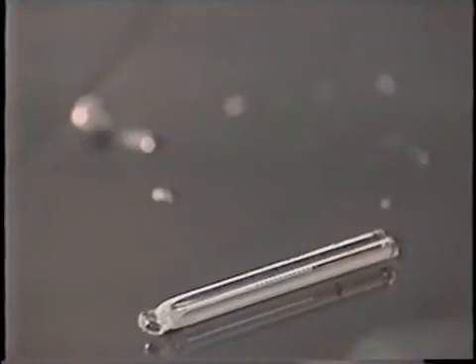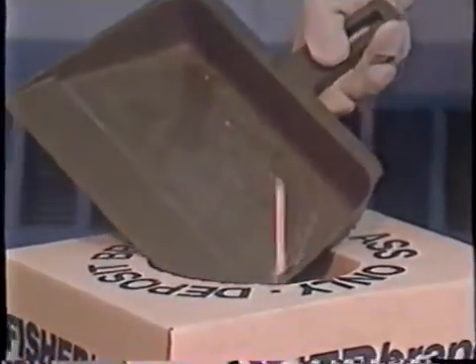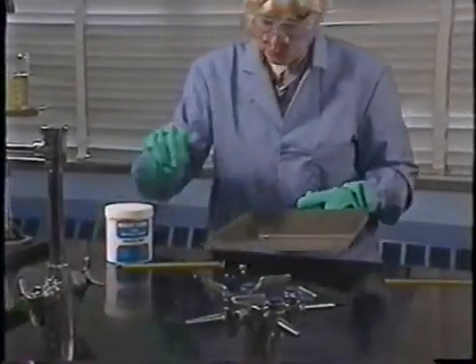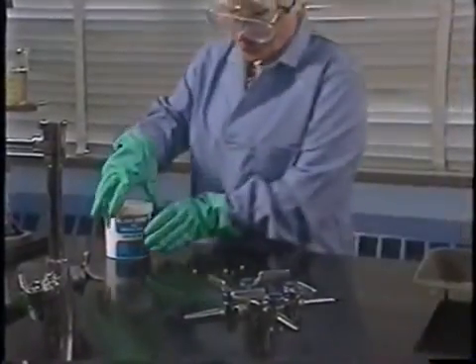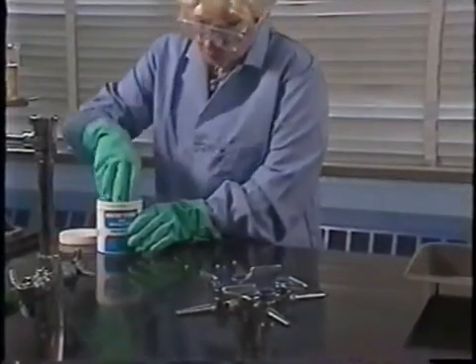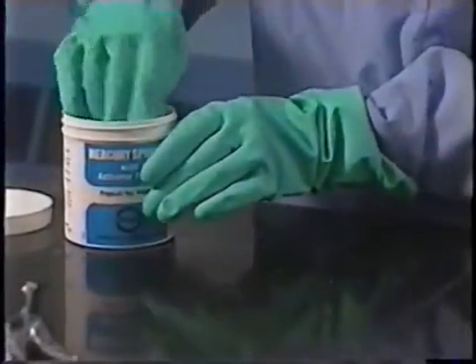When a thermometer breaks, the glass and any liquid that spills out must be cleaned up and disposed of properly — this is a job for your teacher. Glass fragments can be swept up. If any alcohol happens to escape from the glass, it can be wiped up with a paper towel. If you work with mercury thermometers, your lab may be equipped with a mercury cleanup kit or sponge. The kit and broken glass should be disposed of in the proper container.